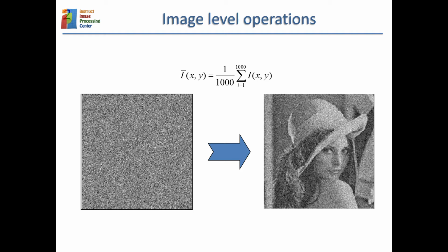And actually, in a very simplistic way, all we do in electron microscopy is averaging in clever ways, trying to align the images so that they can be correctly averaged. But the whole problem is, in the end, averaging.